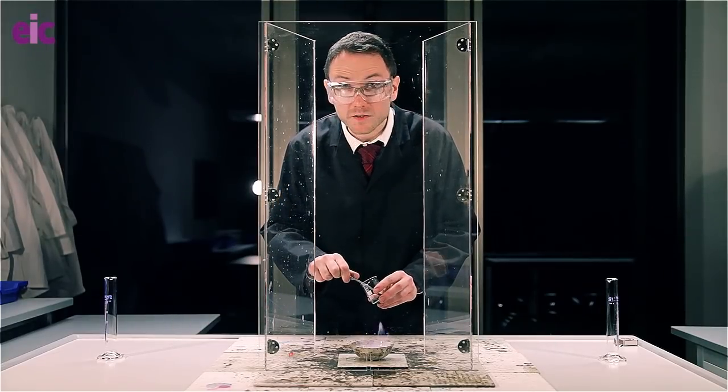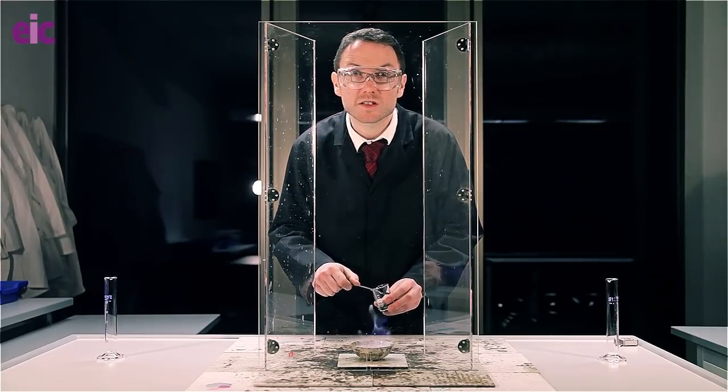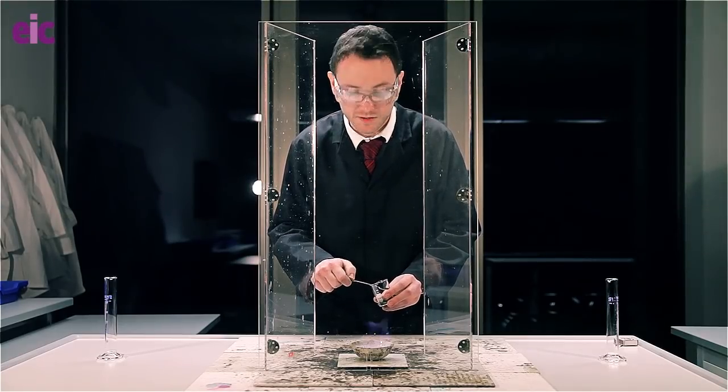All I need to do is add about 0.5 grams of potassium permanganate at arm's length, making sure that both myself and the audience are protected by safety screens.